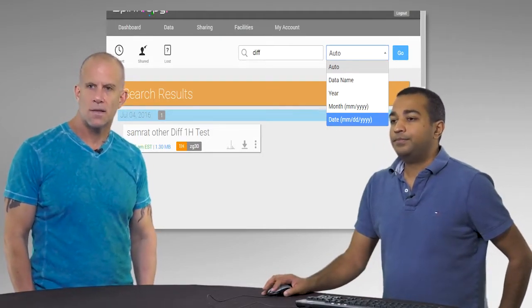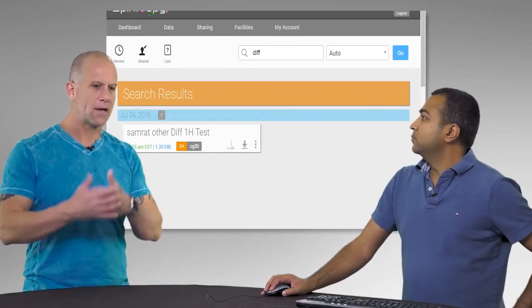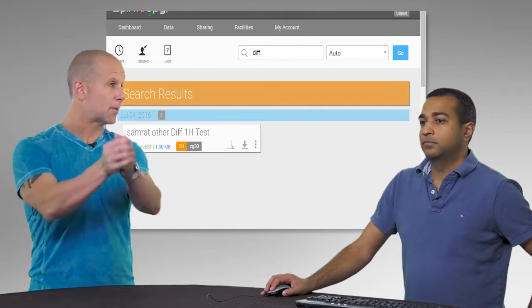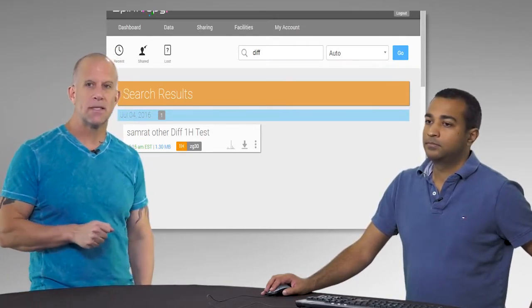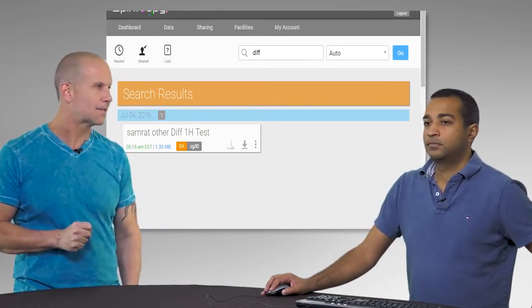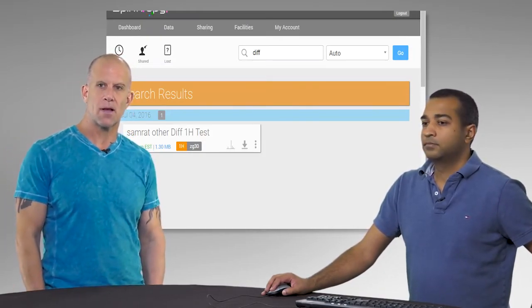Okay. Well, I think that covers the basics from the computer standpoint on IconNMR, entering the data necessary to be able to submit a sample. And then once that sample has been submitted, being able to get onto Spintropy and access that data, either download it or, if it's a 1D, look at a quick plot of it.